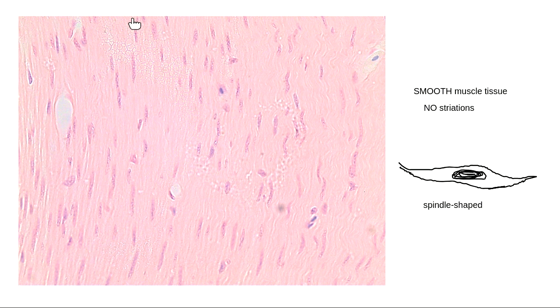Hey, I need you to make a note for yourself, and it says this in your guided lesson, but I need to make sure that we actually do this. Compare smooth muscle to dense, regular connective tissue. Should have pulled a picture in, I apologize. Dense, regular connective tissue looks a lot like smooth muscle. We need to be able to distinguish between those two because I guarantee there's going to be questions on the homework assignment and probably on the exam that asks us to tell the difference.